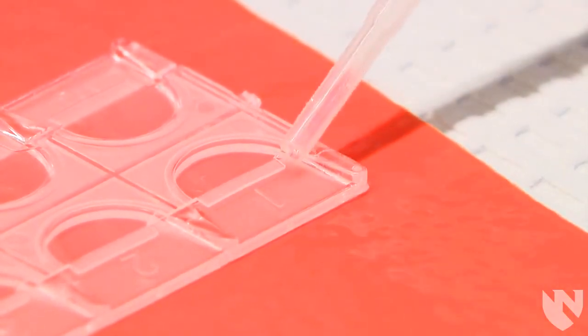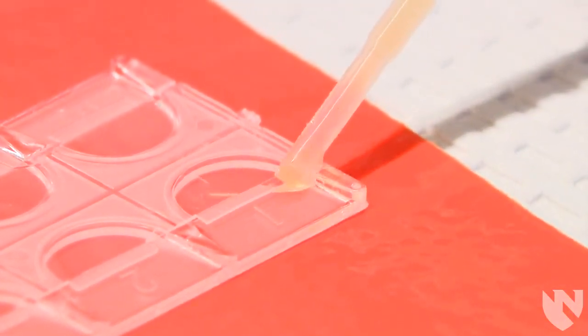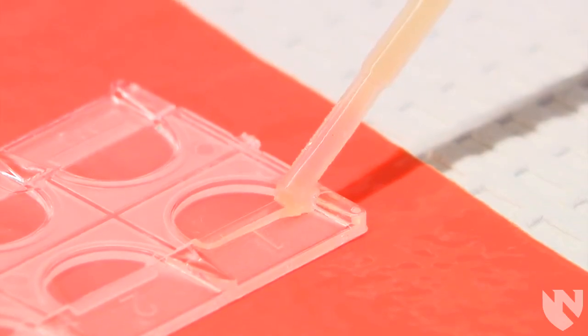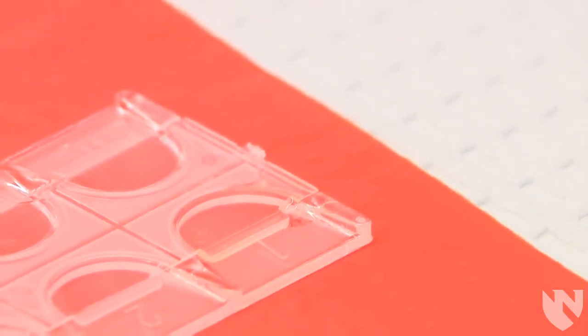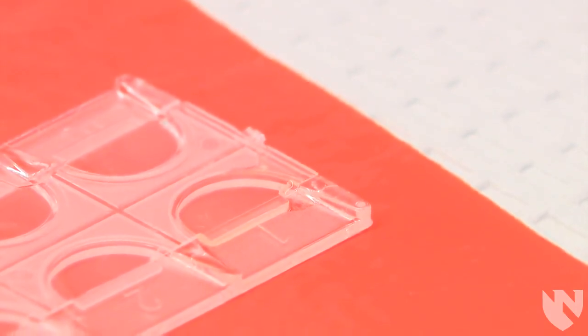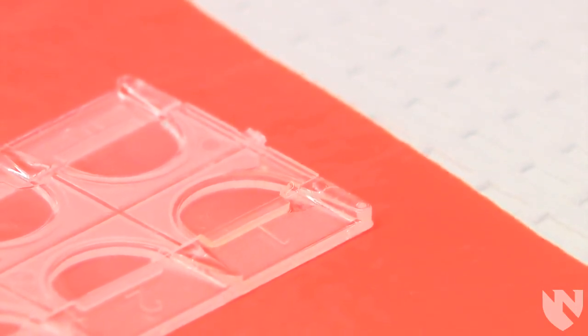Gently squeeze the pipette bulb until some of the urine leaves the pipette. The well fills by capillary action. Continue to squeeze the pipette bulb in one fluid motion until the well is completely filled with no bubbles.